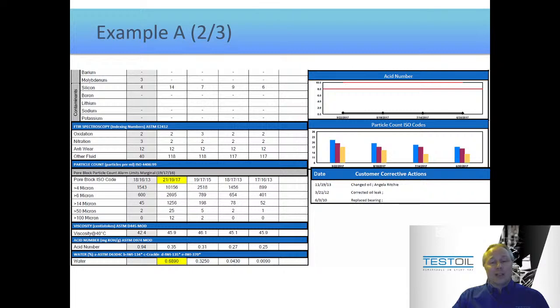In fact, that almost looks like I made up the numbers, right? And if I was making up numbers, I actually wouldn't even make them up to be that exact, because it just doesn't seem believable. But this is a real report, and that is the trend, and that is exactly the kind of trend you're looking for.